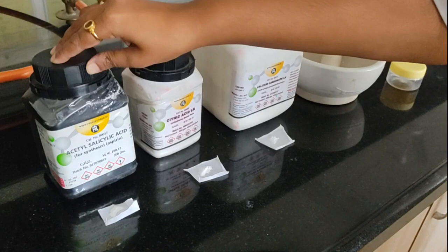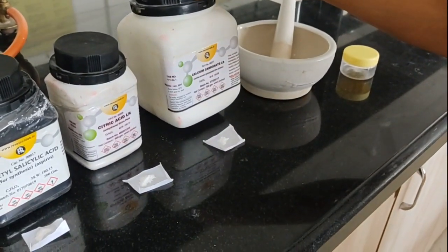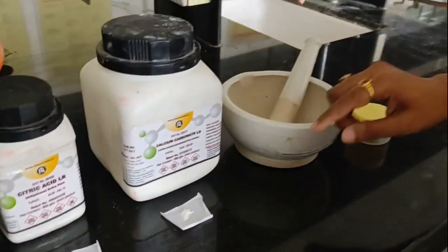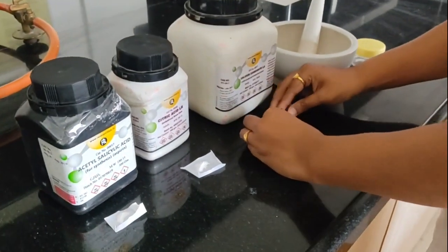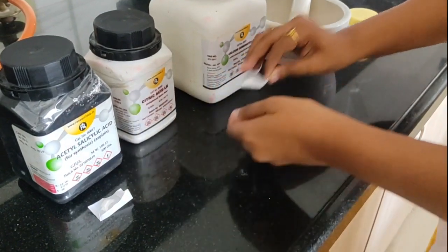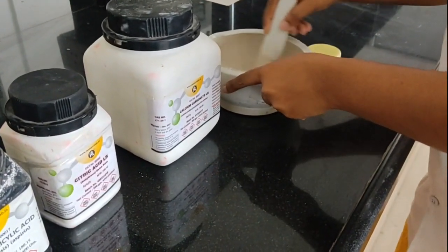So we have acetyl salicylic acid, that is aspirin, which is previously weighed. This is the citric acid, which is previously weighed, and this is the calcium carbonate, which is previously weighed. And this is a mortar and pestle. Now all these are in powder form. So I am going to first take this calcium carbonate and this citric acid into the mortar and pestle and proceed for trituration of both of these powders.